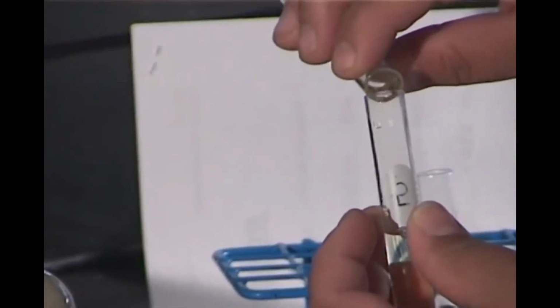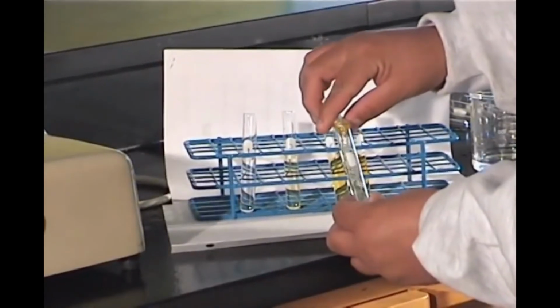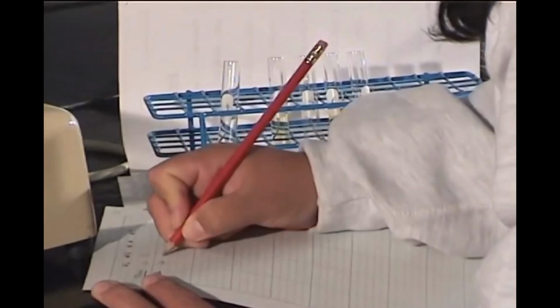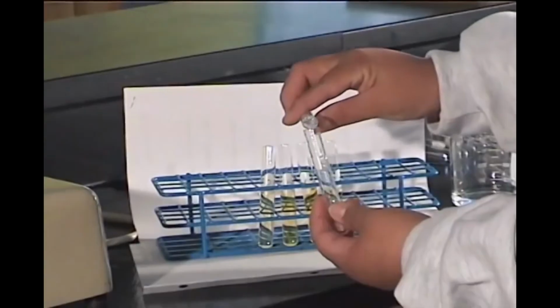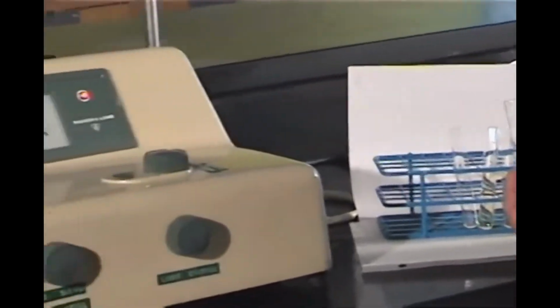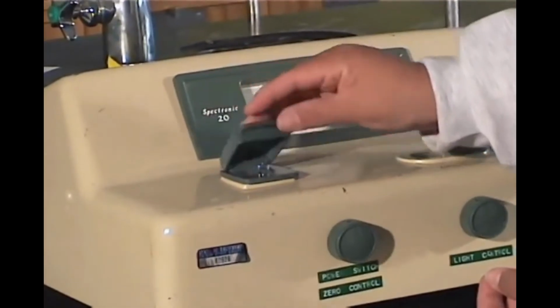We pour the sample back into its test tube and rinse out the cuvette with distilled water. We now rinse the cuvette with a small amount of the next darker sample, then fill the cuvette with it and determine its transmittance and absorbance. After the second reading, it is wise to use the control solution again to recheck that the instrument still reads 100% transmittance with the control solution in place and 0% transmittance with the sample holder empty.